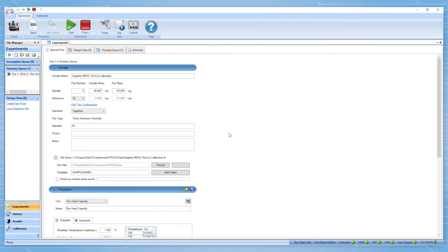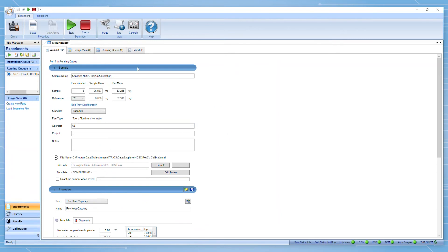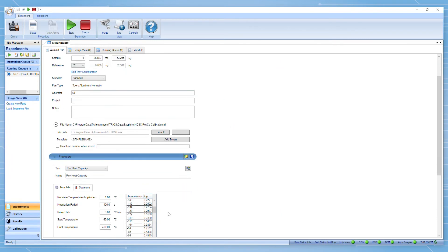Here we can see that all of the parameters we selected are maintained. Once this is confirmed, we can start the experiment.